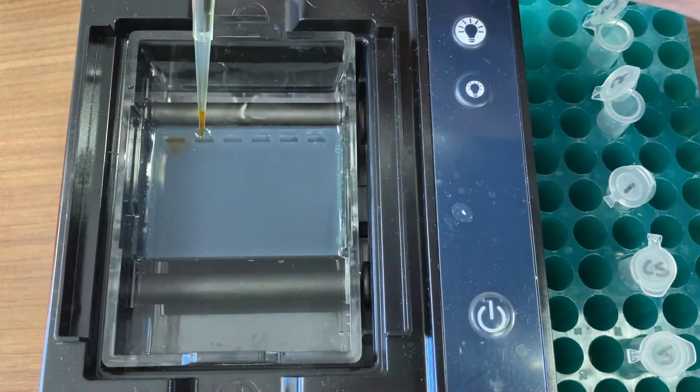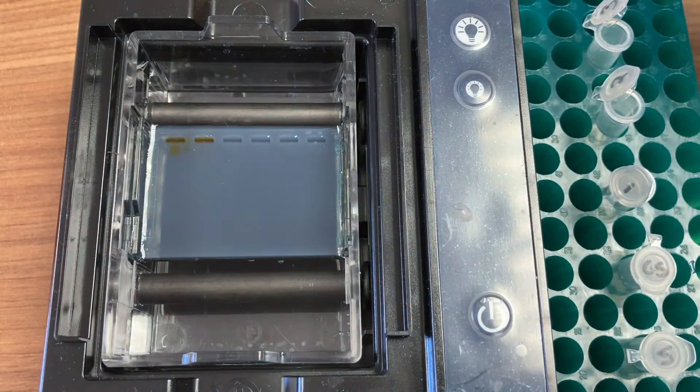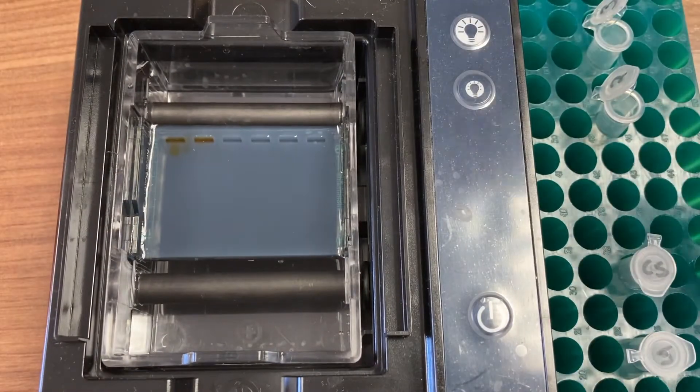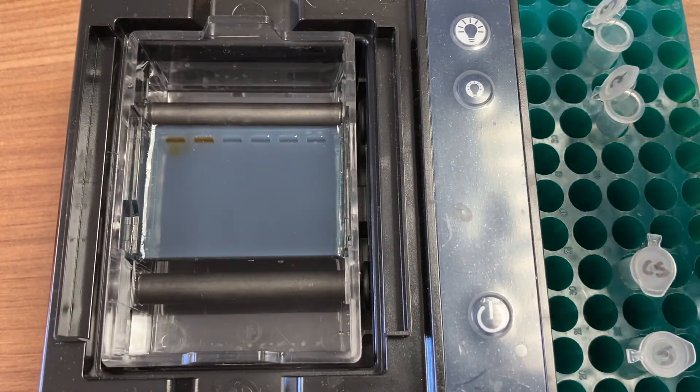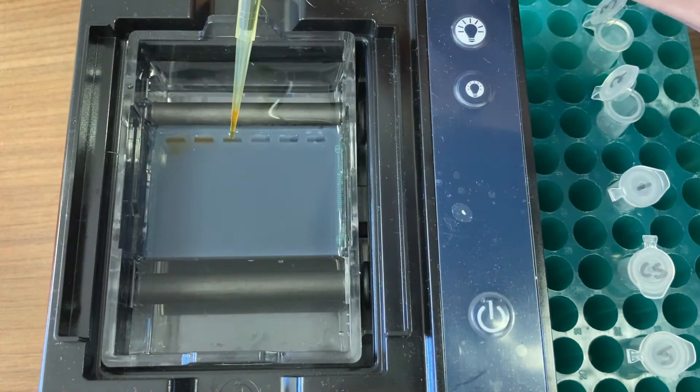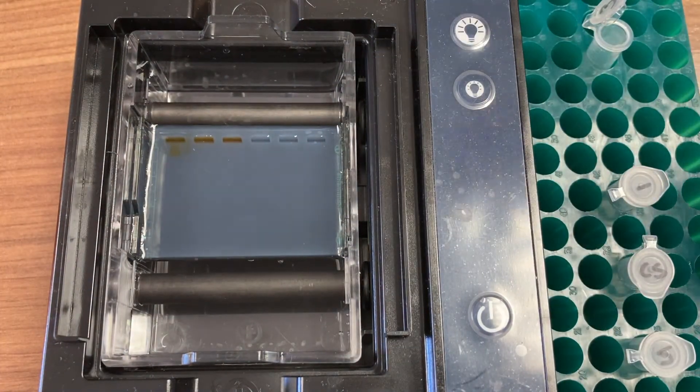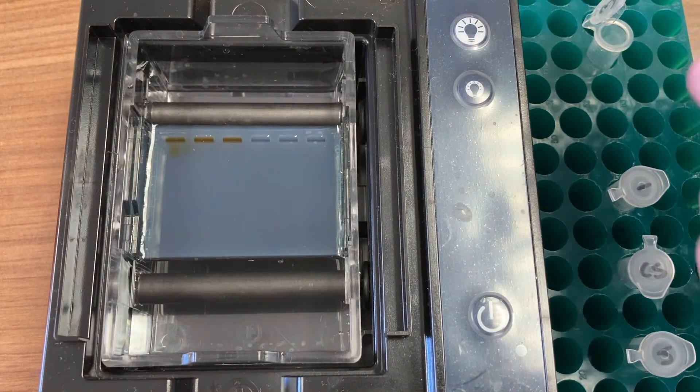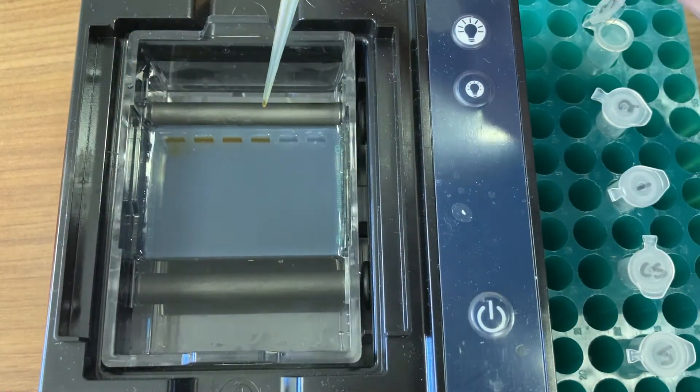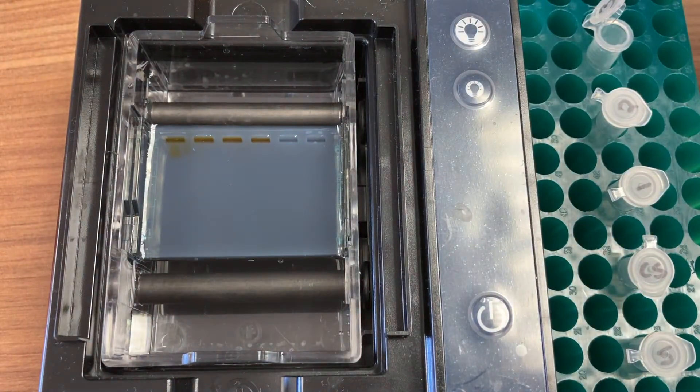We will be running electrical current through the gel, and you may be able to see a positive sign near the bottom of the system. That's important because DNA has an overall net negative charge, and it's going to move towards the positive end of the box. Remember this when you're looking at your results.